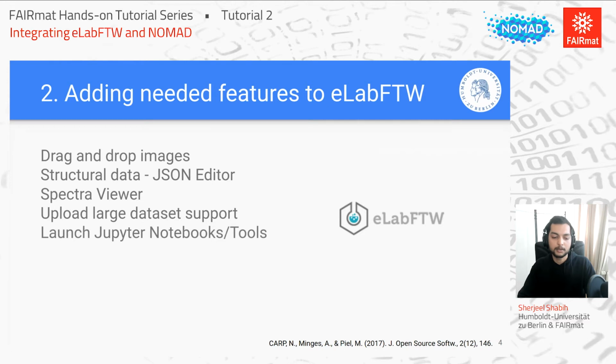And then we also do not want to duplicate data.